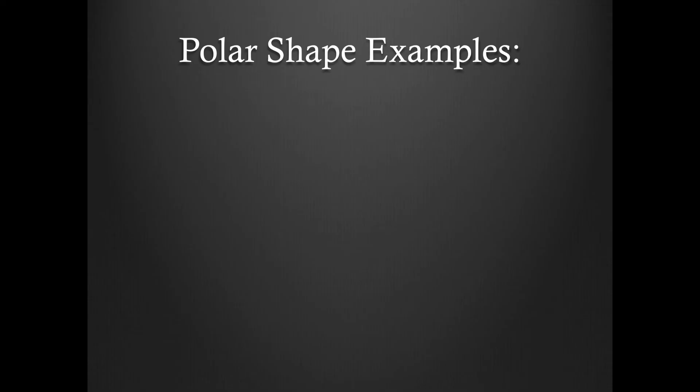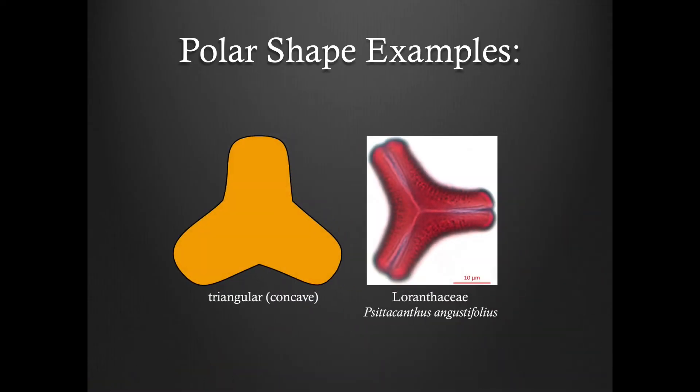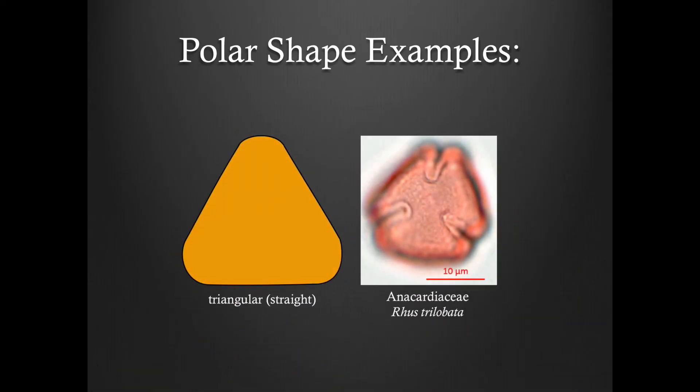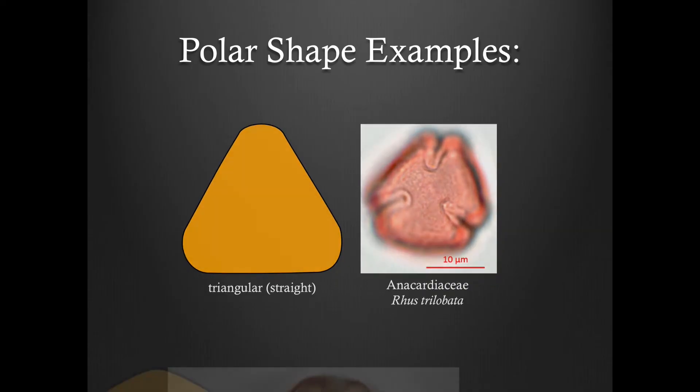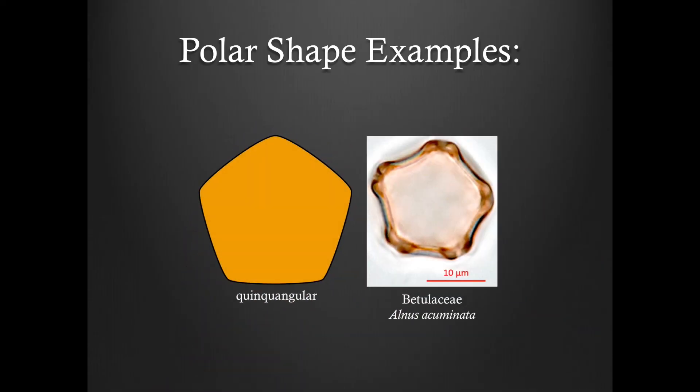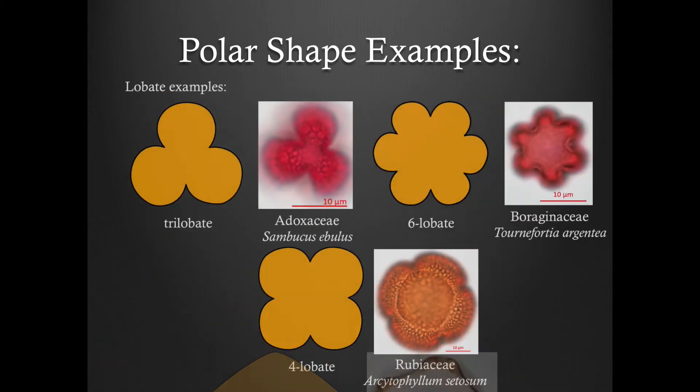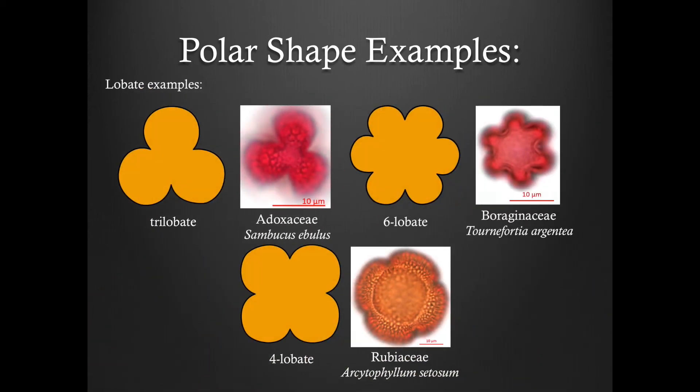Now here are some examples. Here is a triangular concave grain. Here is a triangular straight grain. Here we have a quinquangular grain. And here are a few examples of loebate grains. As you can see, the number of lobes present may vary.